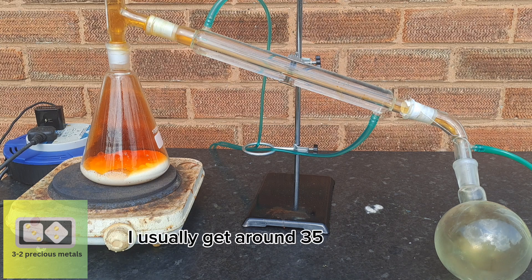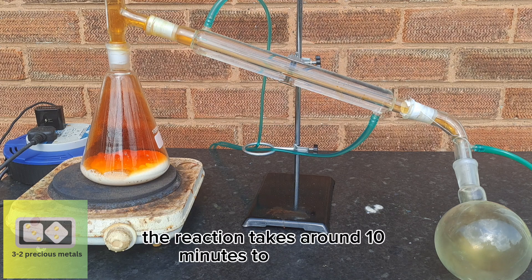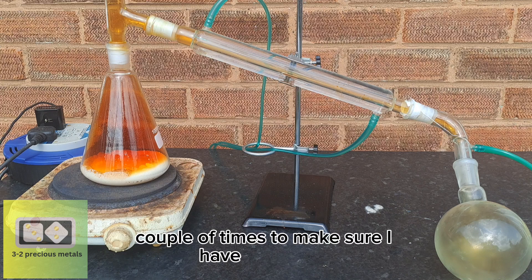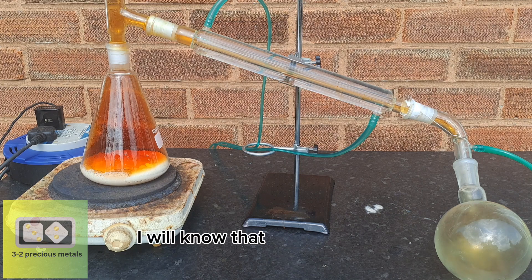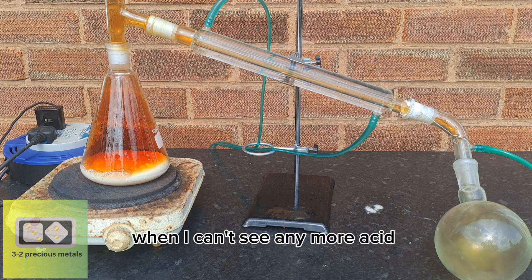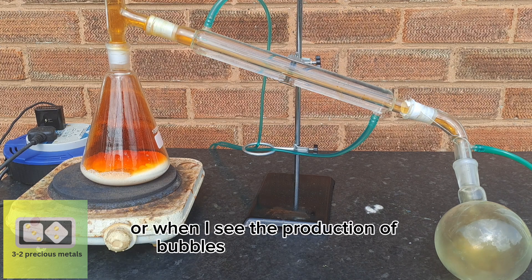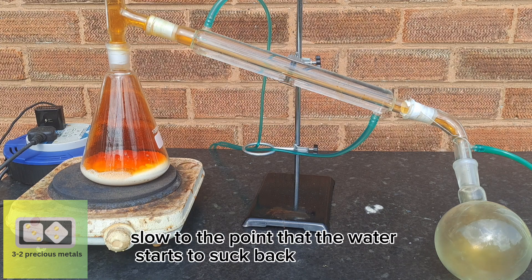I usually get around 35 milliliters of nitric acid each time I do this reaction. The reaction takes around 10 minutes to complete, so I'll be doing it a couple of times to make sure I have enough to dissolve the 55 grams of silver. I will know the reaction is complete when I can't see any more acid dripping into the receiving flask, or when bubbles in the graduated cylinder slow and the water starts to suck back up the pipe.